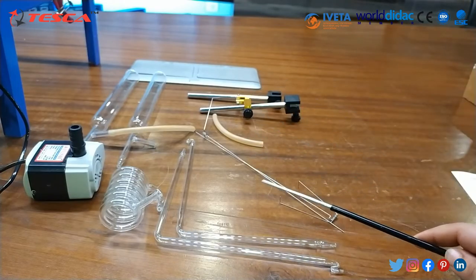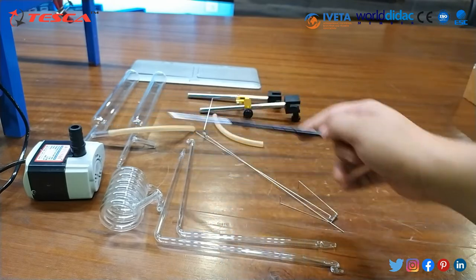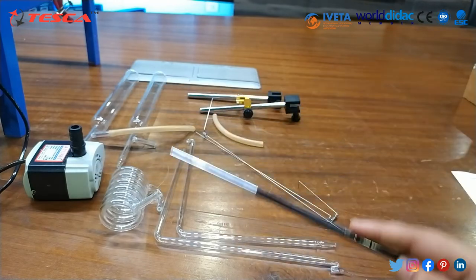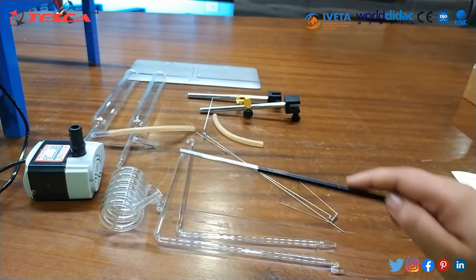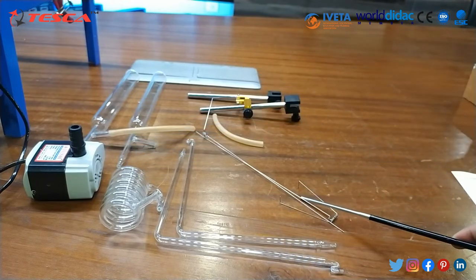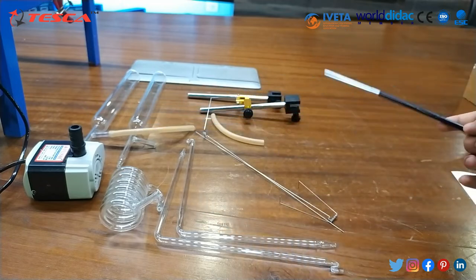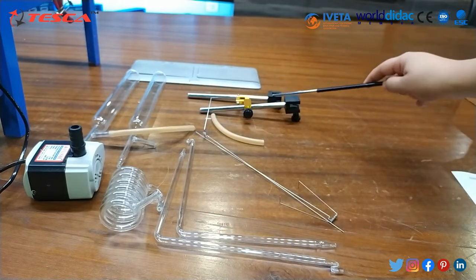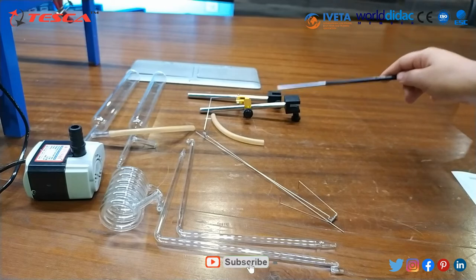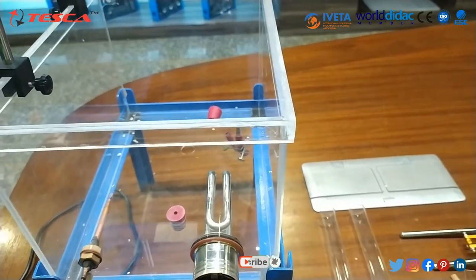These are some additional accessories provided: organ tubes and oxygen tubes — two tubes in total. This is the water pump, this is a coil, and these are the levers. There are rubber tubes which will be used to connect the different tubes, and these are the brass uprights with brass heads.